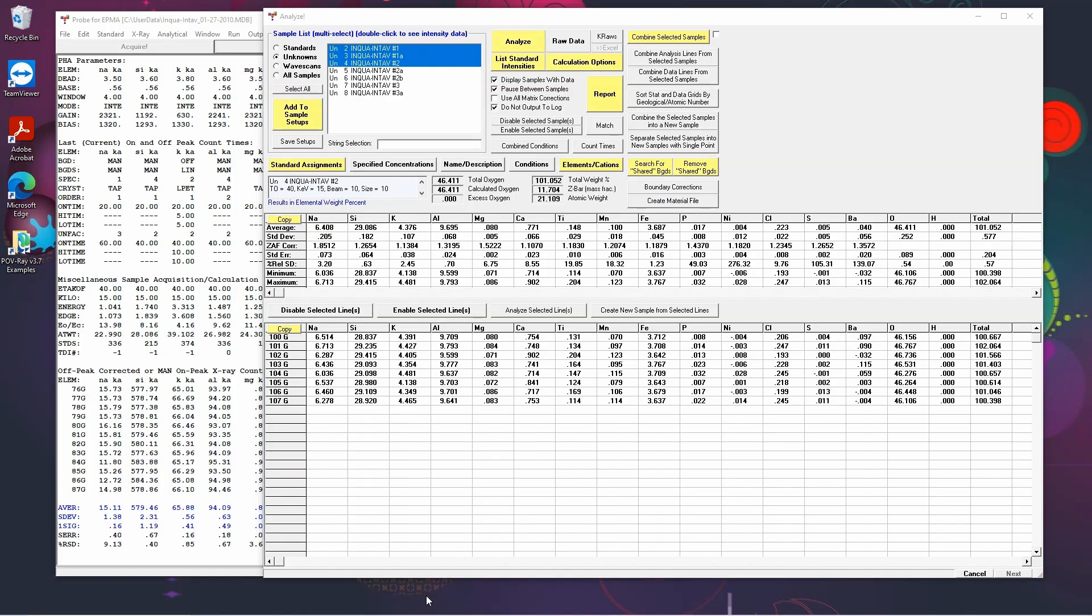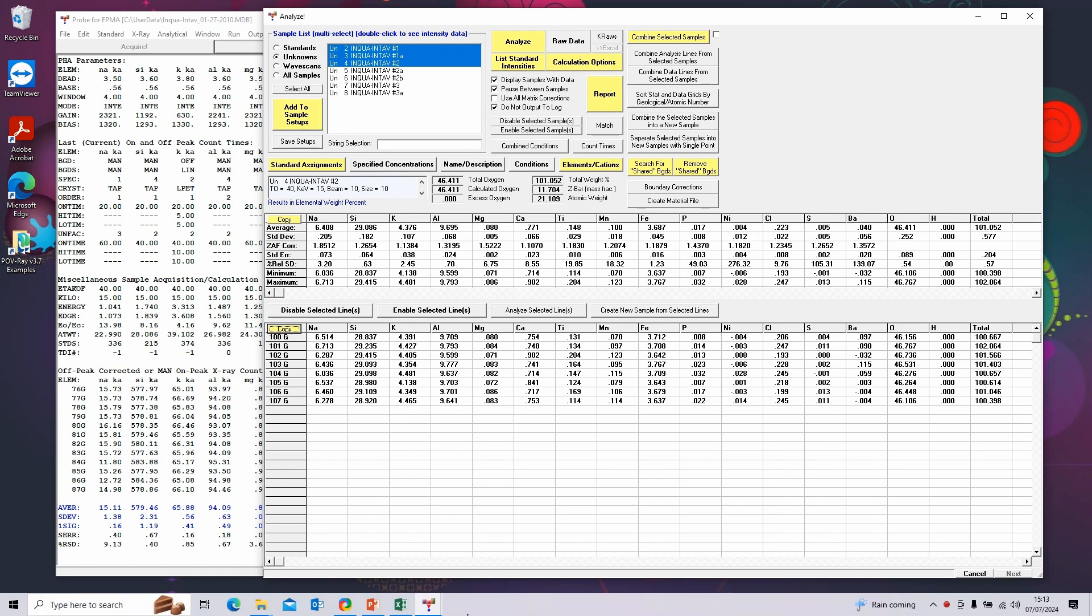In part one we looked at processing the data using the analyze window and we can output the data from the analyze window as well. You'll see that each of the summary boxes and the individual data point boxes has a copy button.